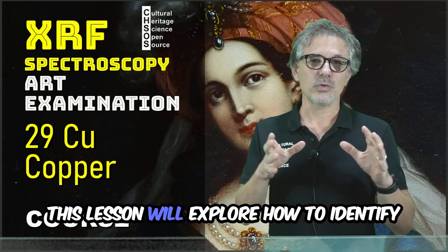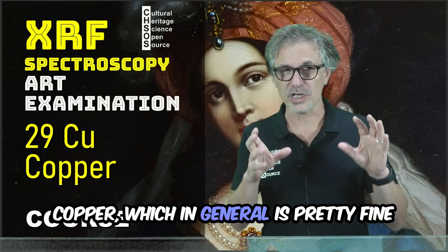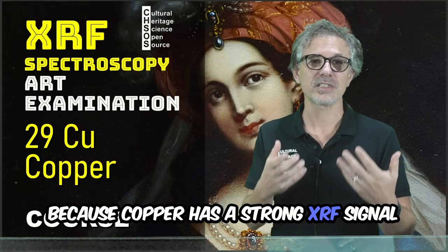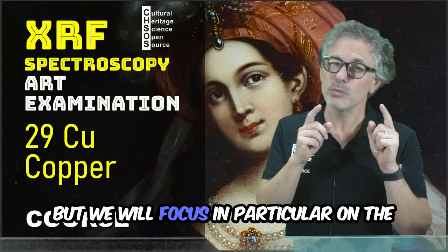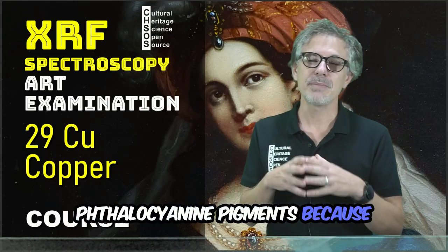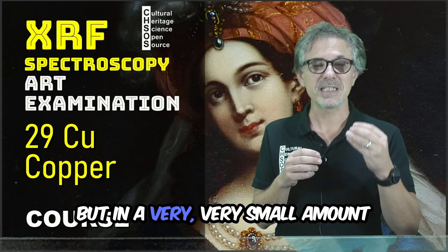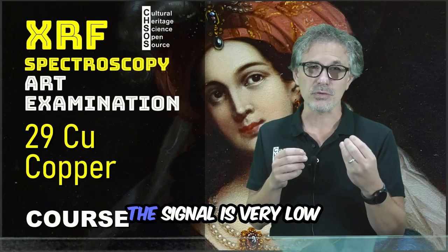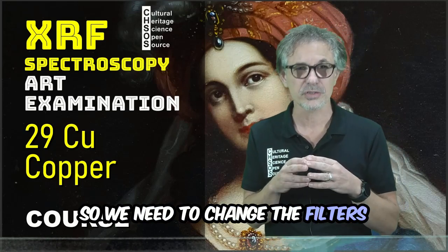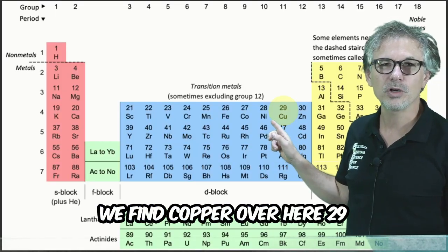This lesson will explore how to identify copper, which in general is pretty easy because copper has a strong XRF signal. But we will focus in particular on the phthalocyanine pigments, because in that case copper is present in a very small amount, the signal is very low, so we need to change the filters in our X-ray tube. We find copper over here, 29.